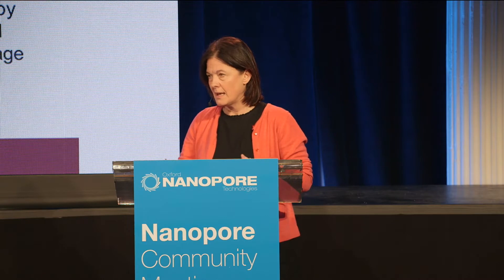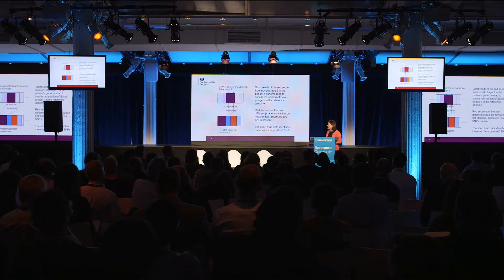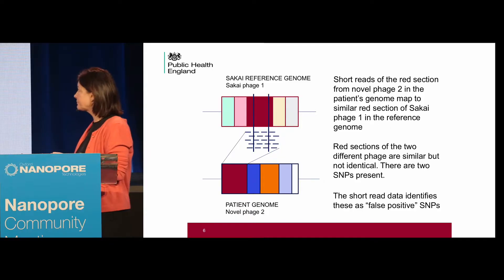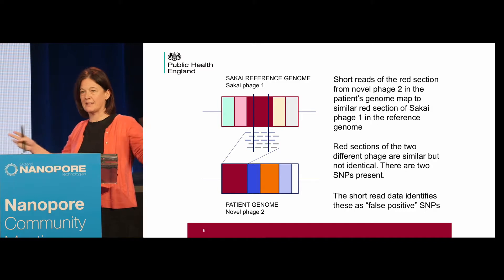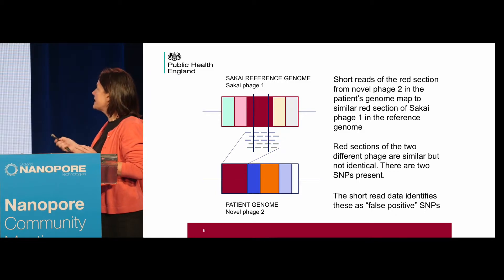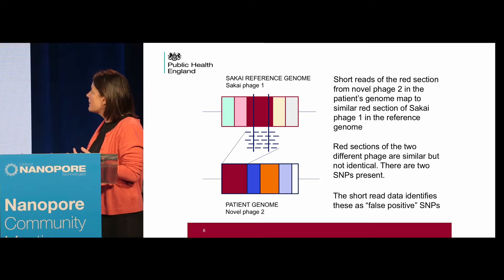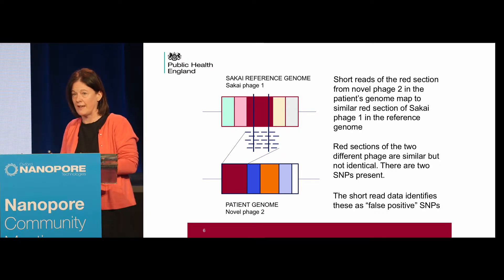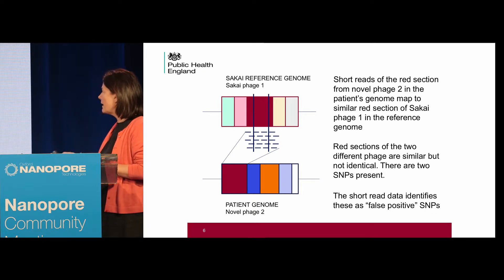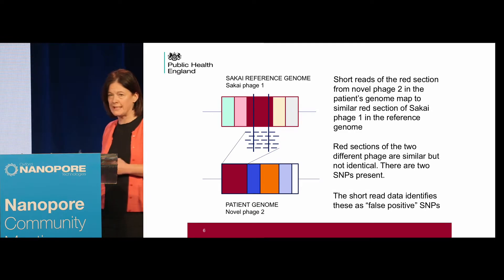This represents a prophage in the patient genome, and this represents a prophage in the reference genome. The long-read technology spans the whole prophage region and recognises that they're different. But with short reads — for example in the red section — reads from part of the patient's phage map to a similar section in a different prophage. The regions are similar but not identical, so the methodology called SNPs in that data. We're suggesting these are arguably false positives in the Illumina data.